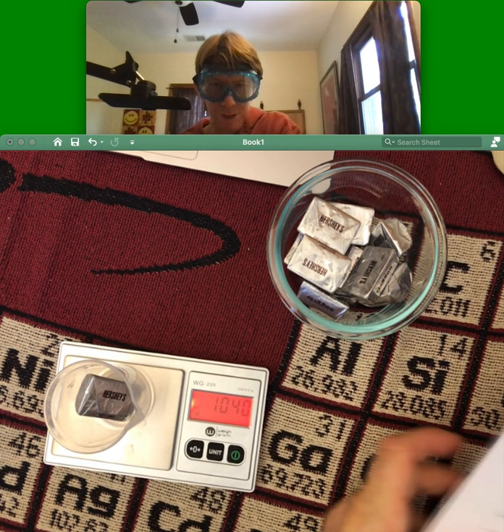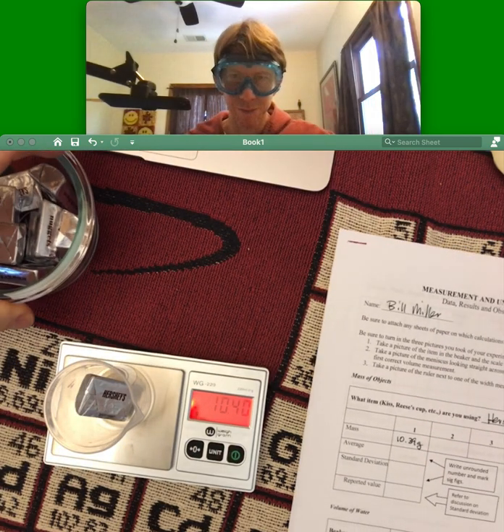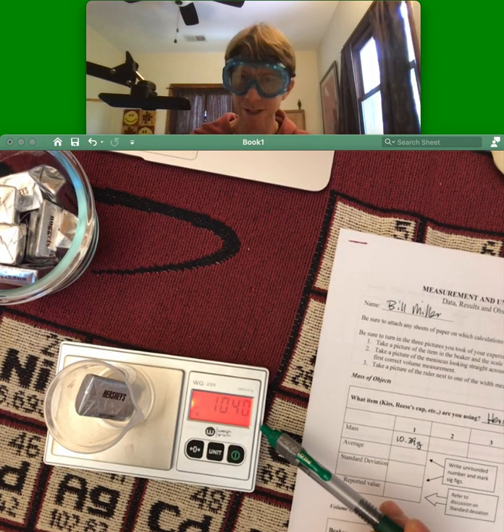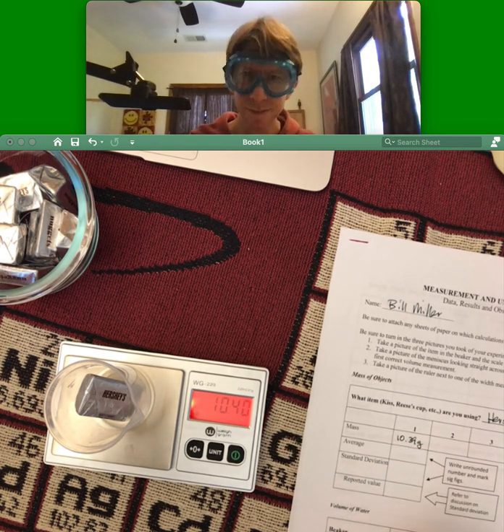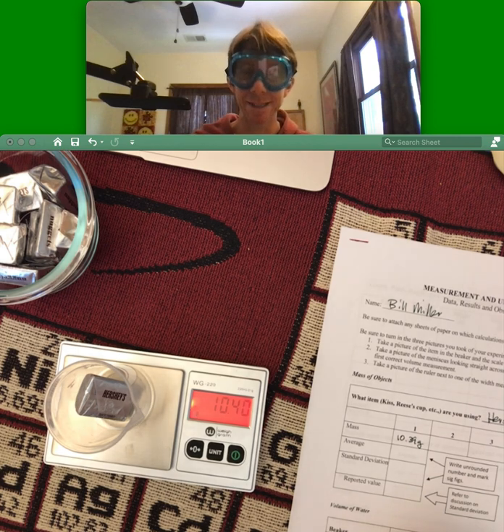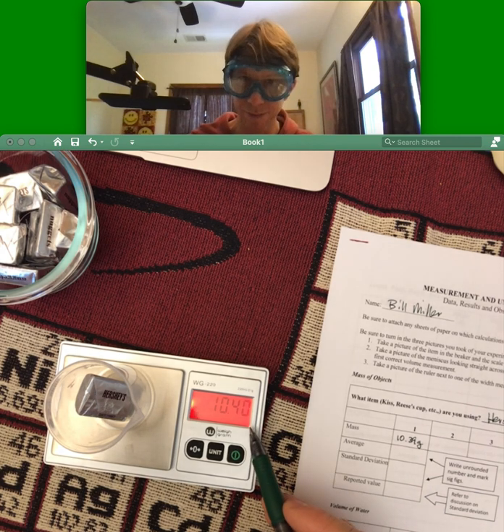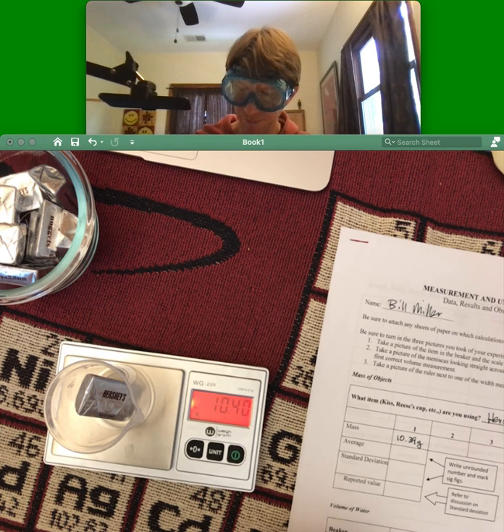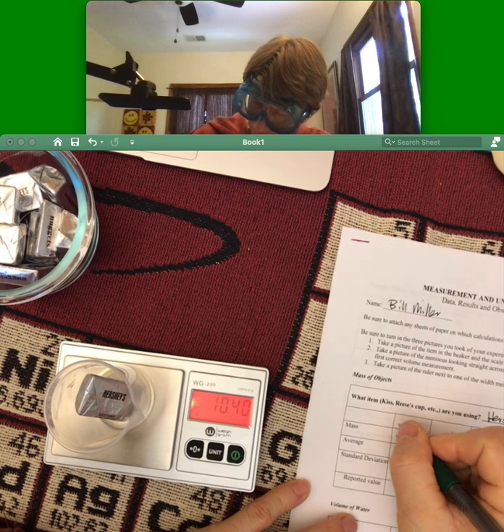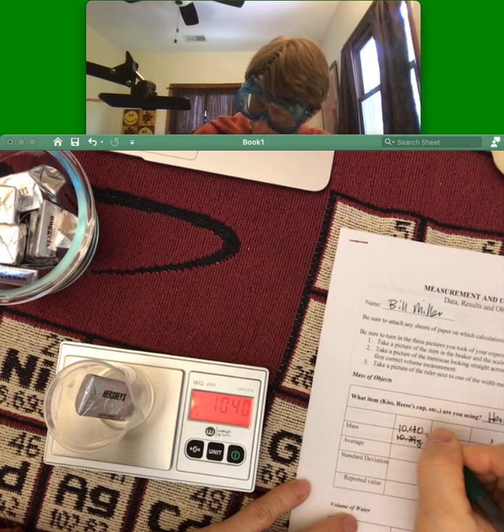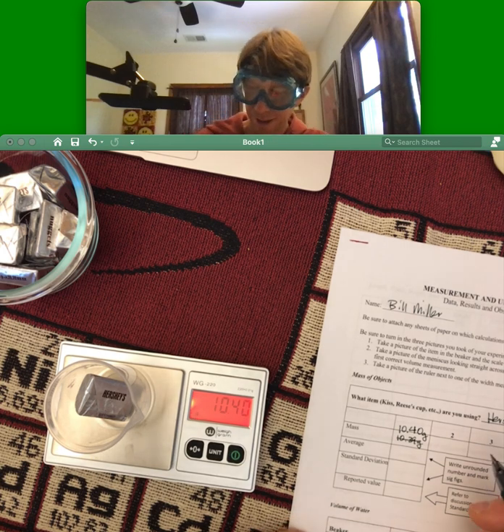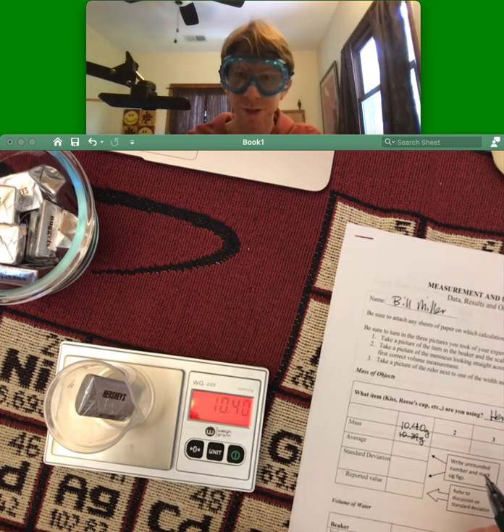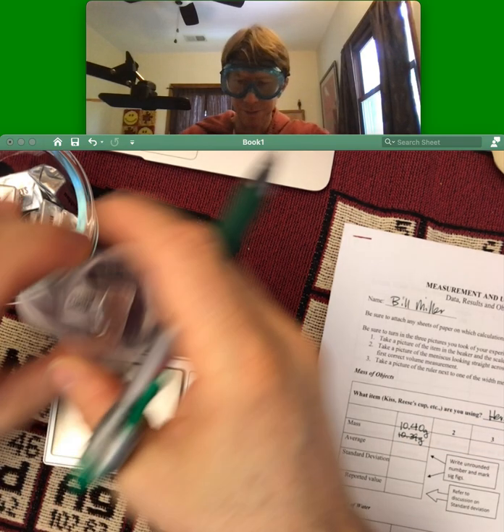And I've just written—can you see that? Good. 10.39 grams. You can see it changes to 10.40, and that's okay because there's error in the last digit, and that just showed up as an error of 0.01. It seems to be staying at 10.40 even longer, so I'm going to single cross out and write 10.40 grams there. If it were to go back, I think I'd just leave it, but it shouldn't be fluctuating much more than that. All right, so that's number one.